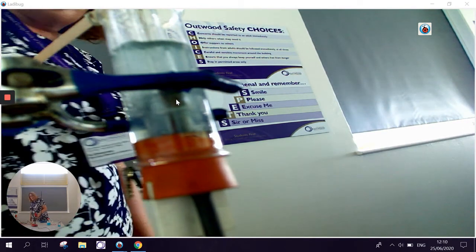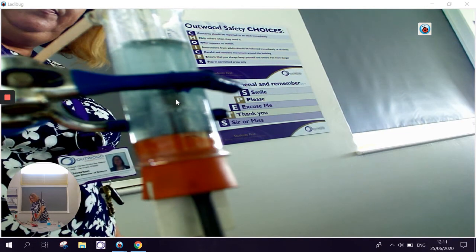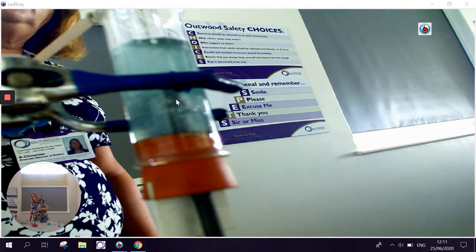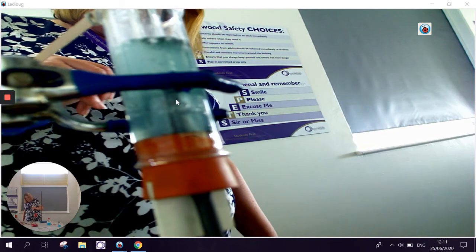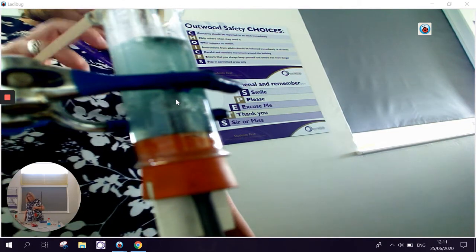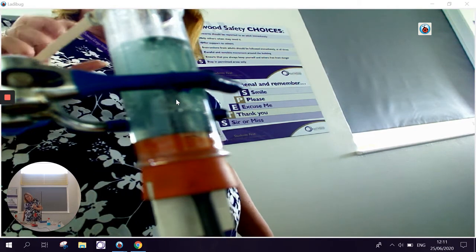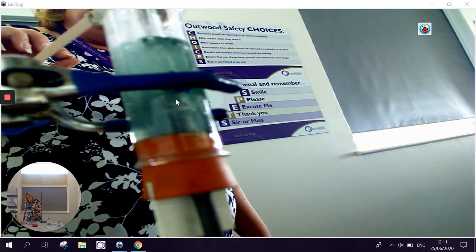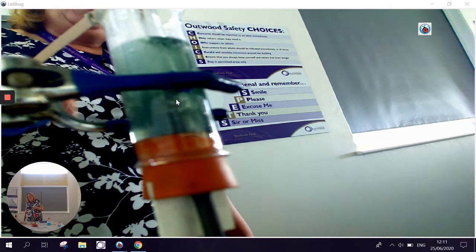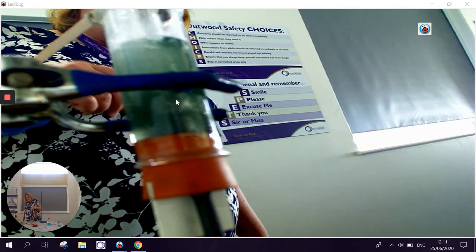A gas is being produced at the positive electrode — I'd expect that to have been formed from a negative ion — and another gas at the negative electrode formed from a positive ion. The little test tubes fitted over the top of the electrodes are collecting some of the gas. We need to run for a while so it displaces any air originally in those tubes. If two gases are formed from the negative and positive ions, we'll also have other ions left behind in solution that will form a different ionic compound to the one we started with.